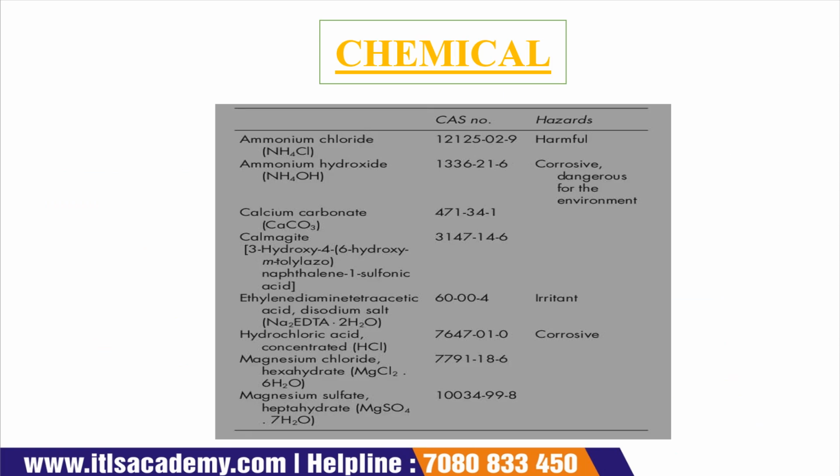Now the next one is the chemicals used for this experiment. We are using ammonium chloride, ammonium hydroxide, and calcium carbonate.